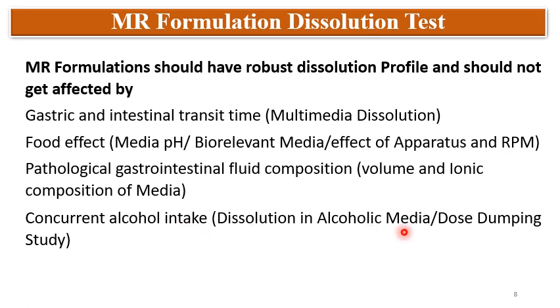So dissolution in alcoholic media is done, and different concentrations of ethanol are taken into the media, like 0.1 normal HCl with 5% alcohol, 10% alcohol, 20% alcohol, and 40% alcohol as per the regulatory requirements, and this dose dumping is studied.